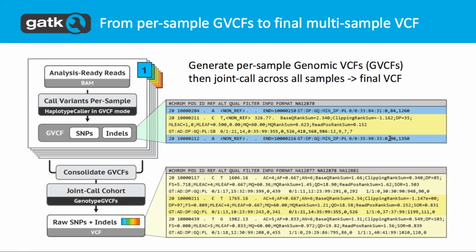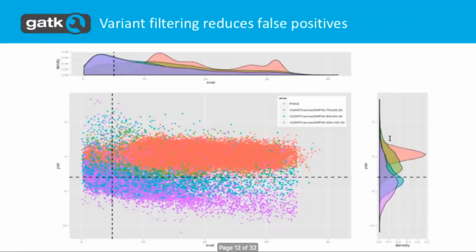You want to somehow show that, well, there could have been a variant there, but probably not. And so you combine different samples in this way. So you basically, in the GVCF, have a field for roughly every position of your genome, and then you do joint calling using that large GVCF.